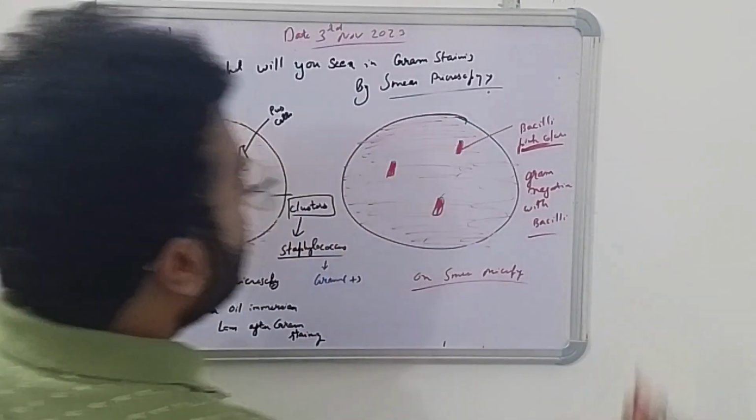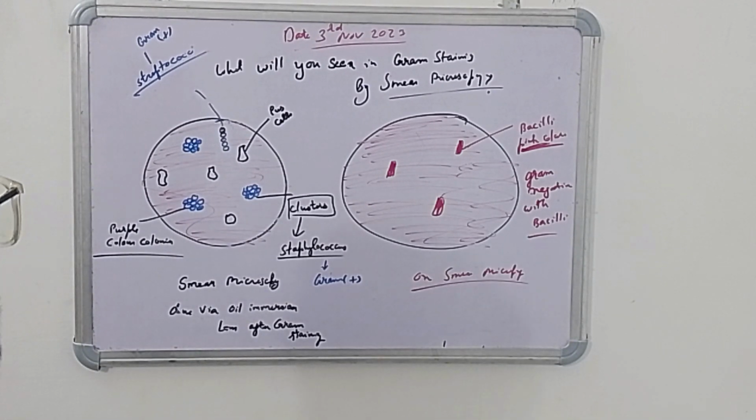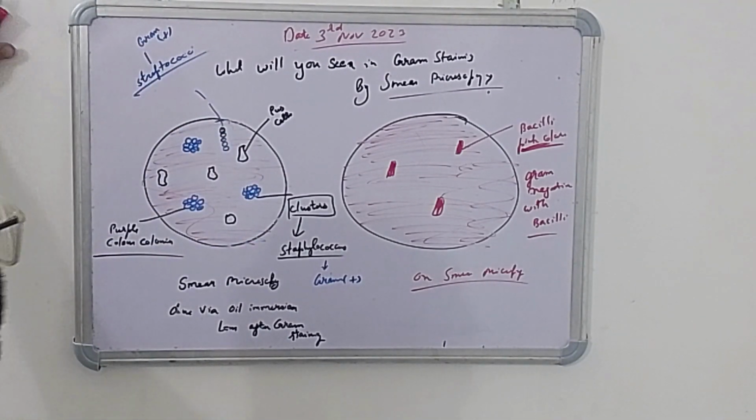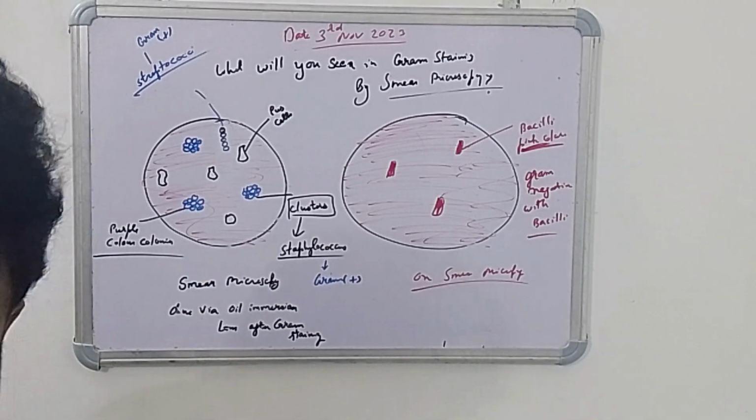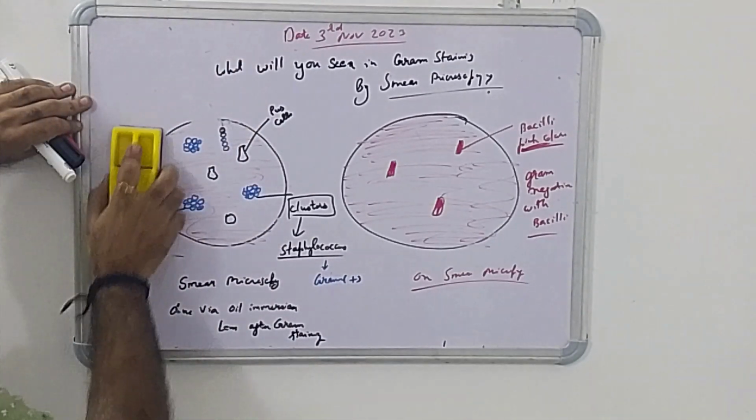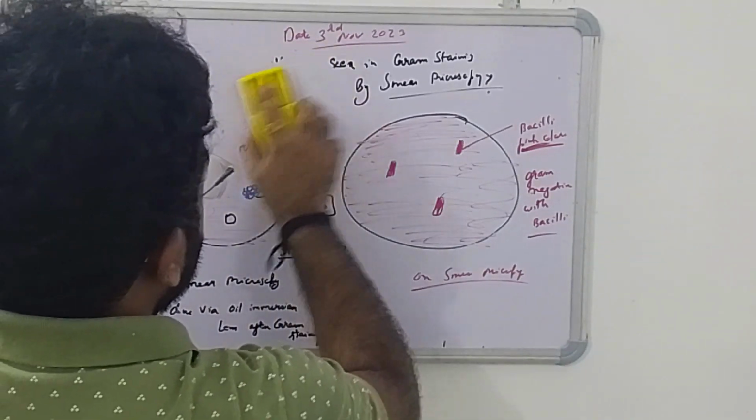I hope you understand this smear microscopy. It's very important. Just take a good look and take a picture or screenshot if you want. So we are rubbing this and moving forward.